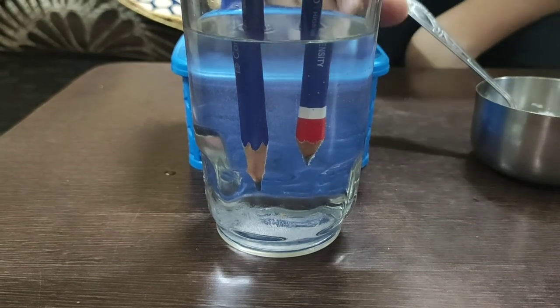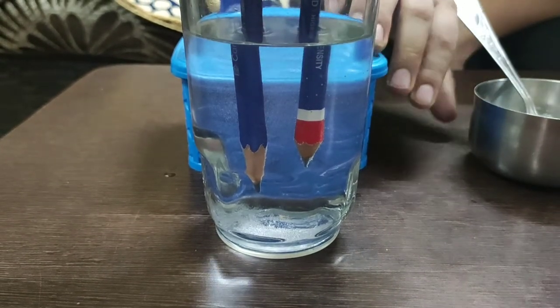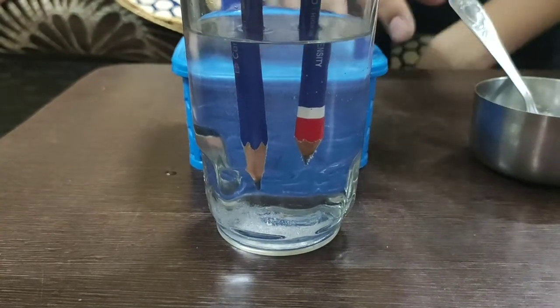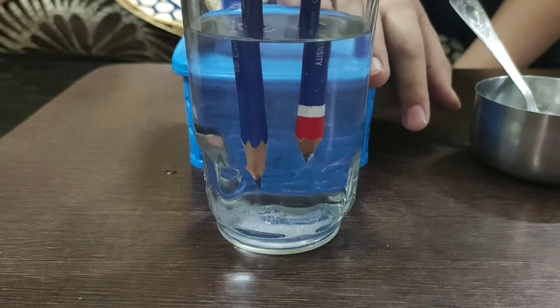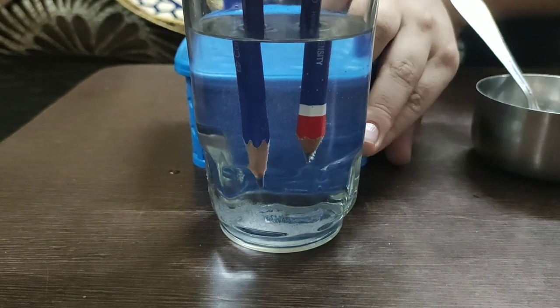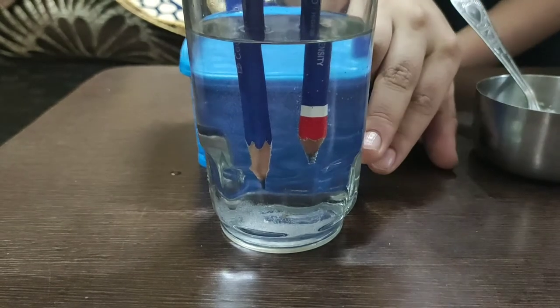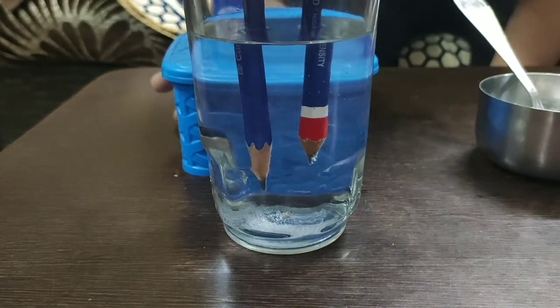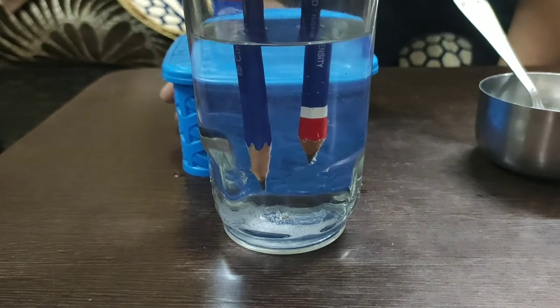As you can see, there are bubbles forming in the water. I already told you that this process is also called splitting of water, because water is splitting into oxygen and hydrogen.